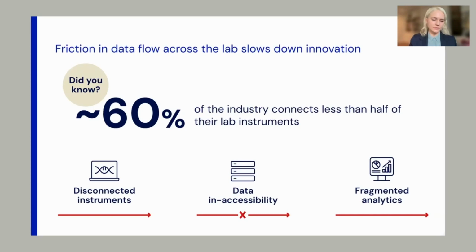So even if you have a reliable workflow for getting data from one place to another, if you're the only one doing it and you don't know how the data got there, then understanding the context of that information, regardless of the tool that you're using, has become lost. This is a problem by itself, but let's take a specific example that a lot of our clients run into. Let's say a few years later, after completing your bioprocess experimentation and you've done a lot of good work in that area, you want to file an IND.